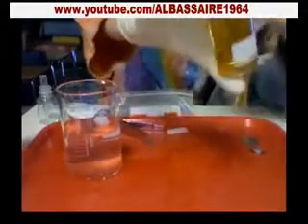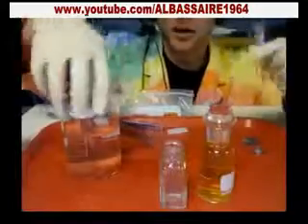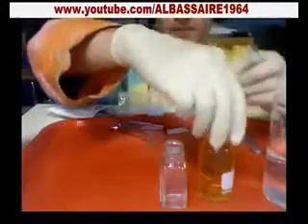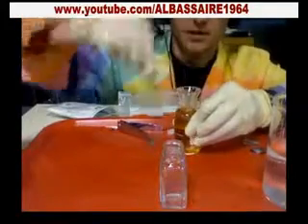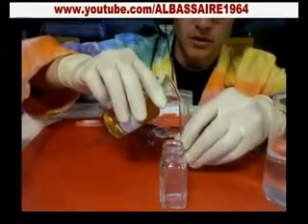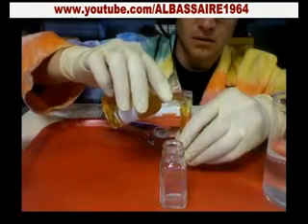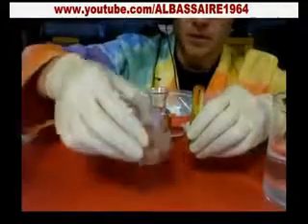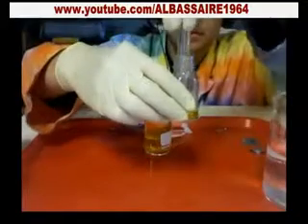So that yellow color means that there is oxygen present. Now what we're doing in this lab is simply a titration, and if you've never done a titration in chemistry before, what we have to make sure we have is a known quantity. The way this kit works is that they have a little vial that allows you to pour in a known quantity. Now we want that to go into this other jar, so what I usually do is just invert it, and then I tip it like that.